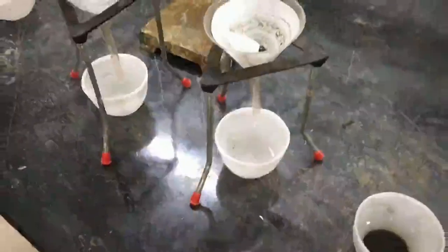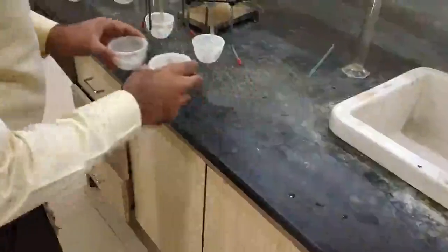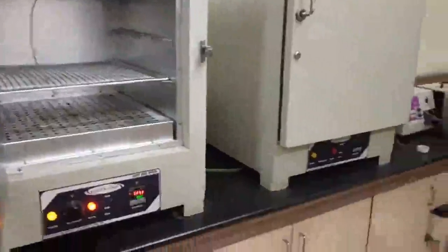So now what we are going to do is keep all these crucibles in the hot air oven. Before that, let me start the oven as well. So we are going to keep the crucibles properly.